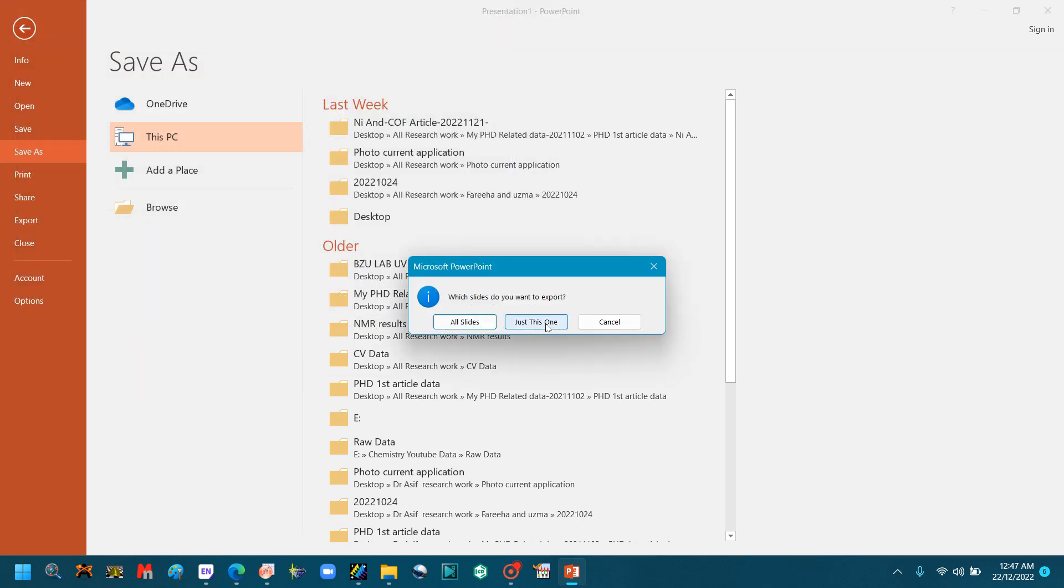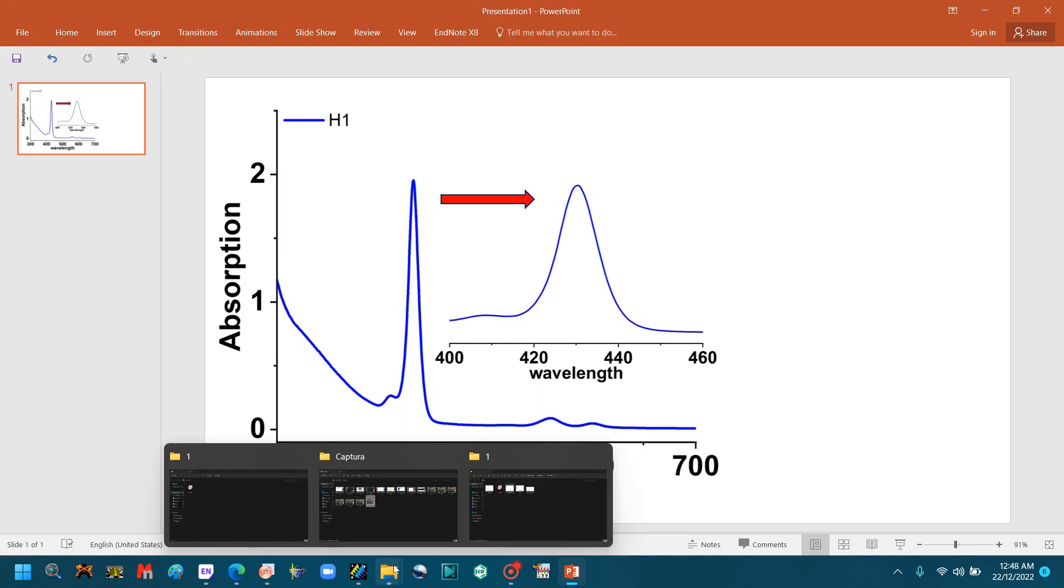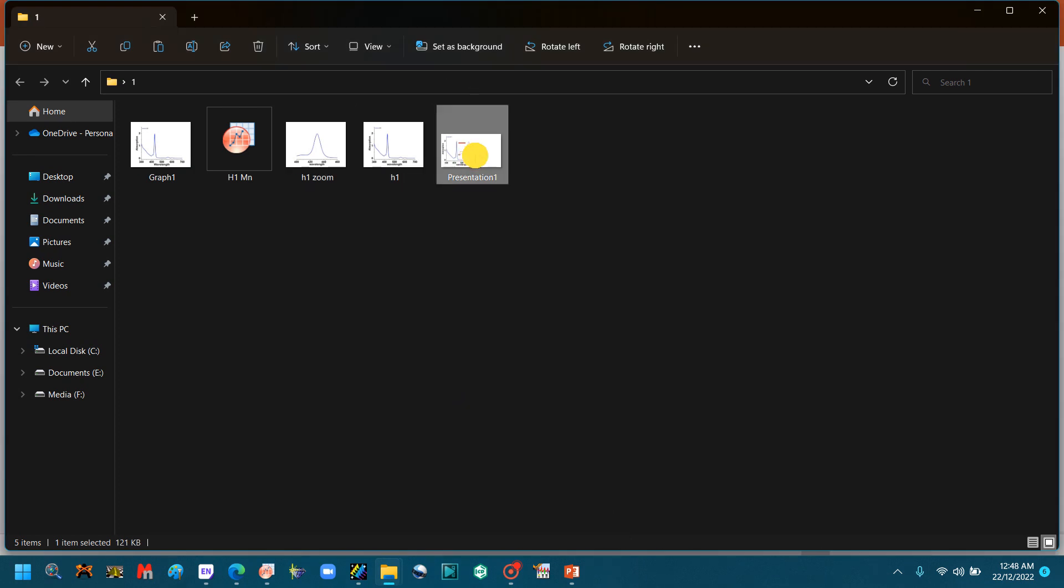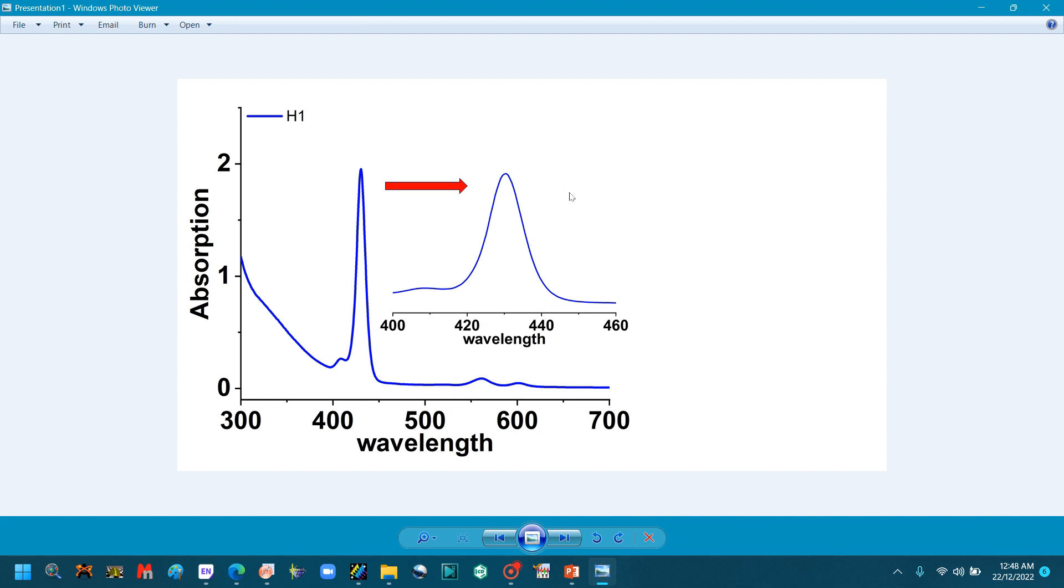This is the TIFF file with both graphs—original graph and zoom file is attached here. When you attach it to the Word file, you can also crop the excess part and present it to the article.